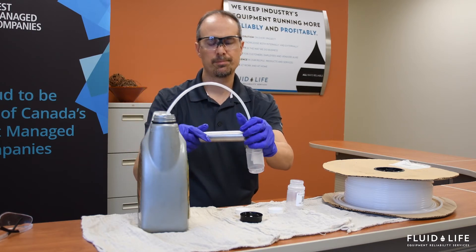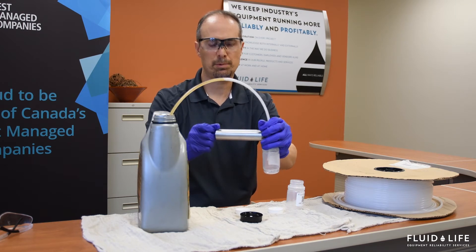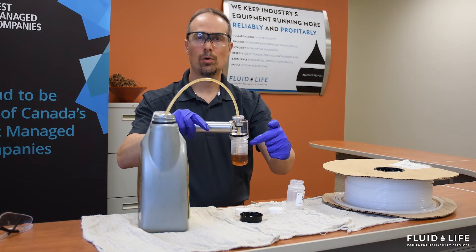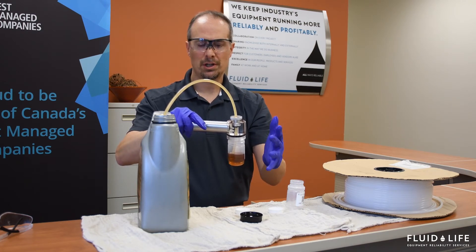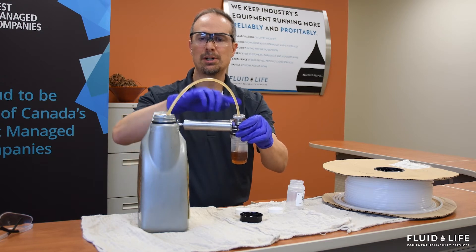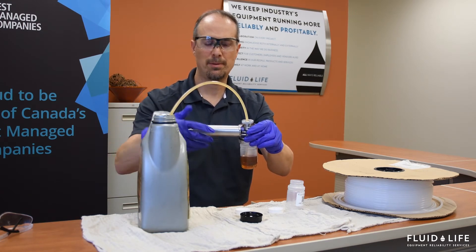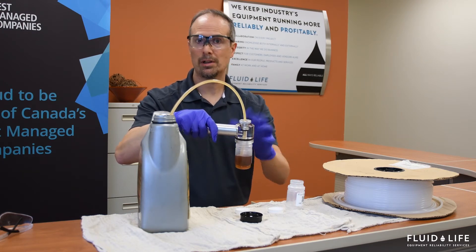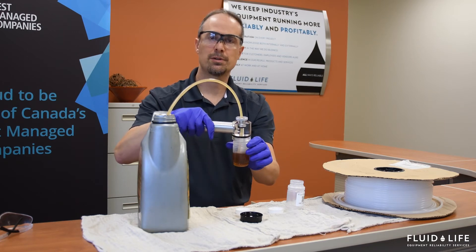Once you get to a good place, you're going to start the flow of oil by pulling this plunger. You'll see the oil flow going into the bottle. This is a flush. You want to flush basically as much oil as you feel is necessary before you get a representative sample. It could be as little as 15 milliliters, it could be half the bottle. It really depends — use your discretion on when you feel that there's a sufficient flush.